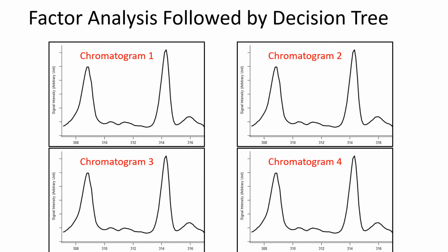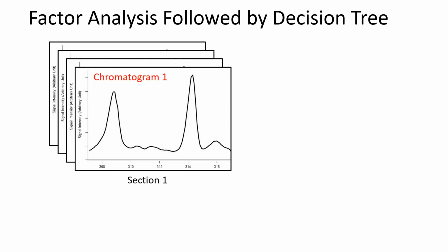Here you can see a roughly 10-second window of 4 chromatograms. These subsections will then be combined and PMF will be performed. PMF focuses on the data pattern that is repeated over the entire set of chromatograms and yields the valuable patterns as factors.